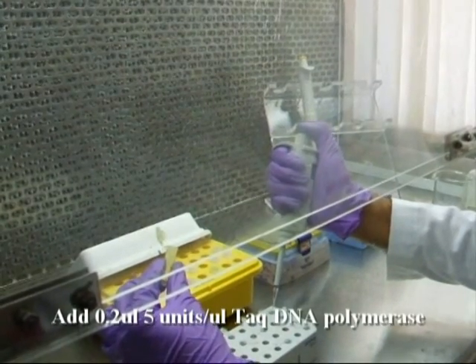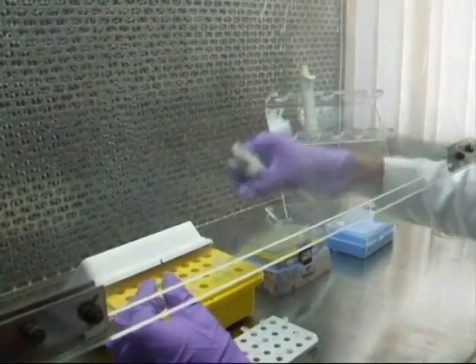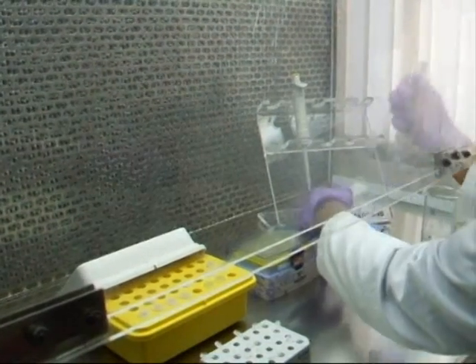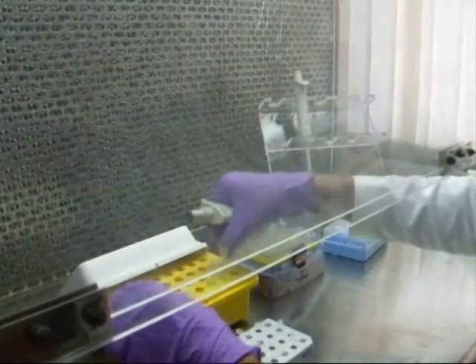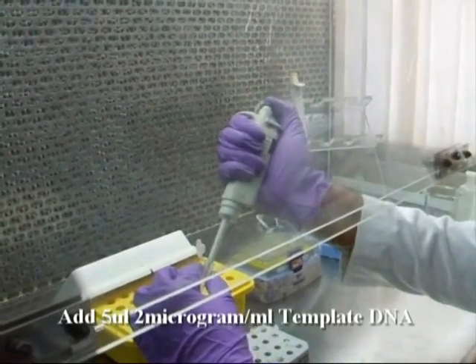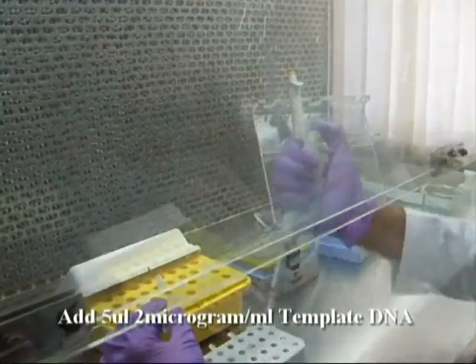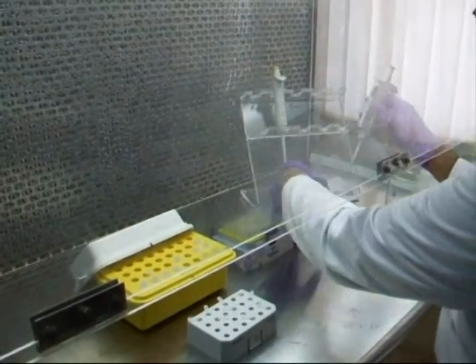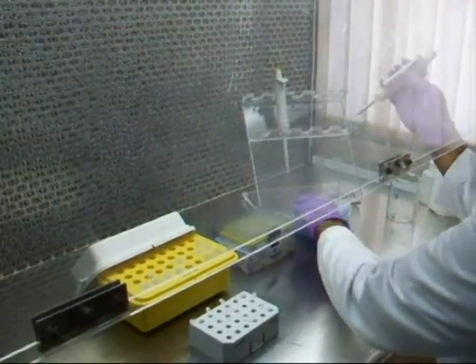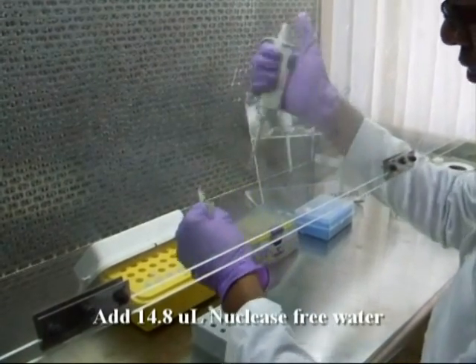Add 0.2 microliters of Taq DNA polymerase. The concentration of Taq DNA polymerase is 5 units per microliter. Now add 5 microliters of template DNA of the concentration 2 microgram per milliliter. Add 14.8 microliter nuclease-free water. This makes the reaction mix to 25 microliter.